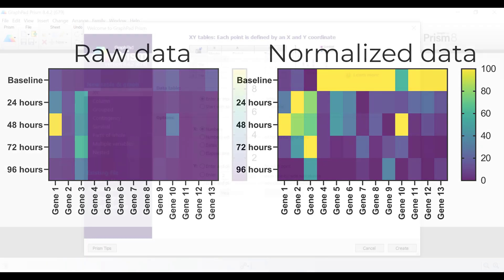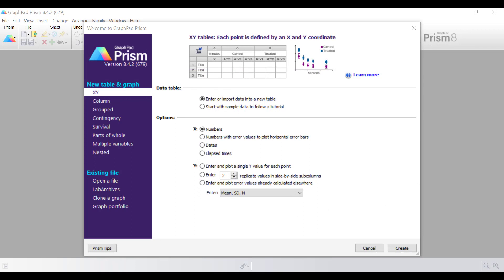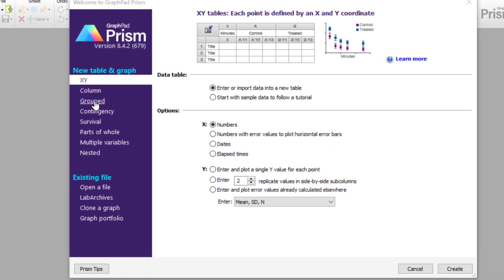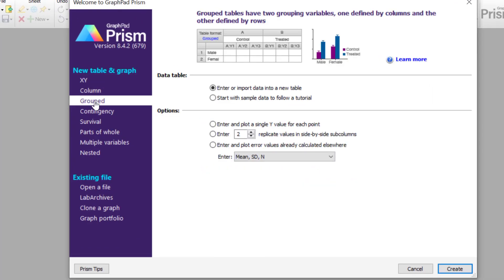So let me now show you, step by step, how I achieve this. For this tutorial, I will start by creating a heat map containing my raw data. To do this, I will use a grouped table in GraphPad Prism.